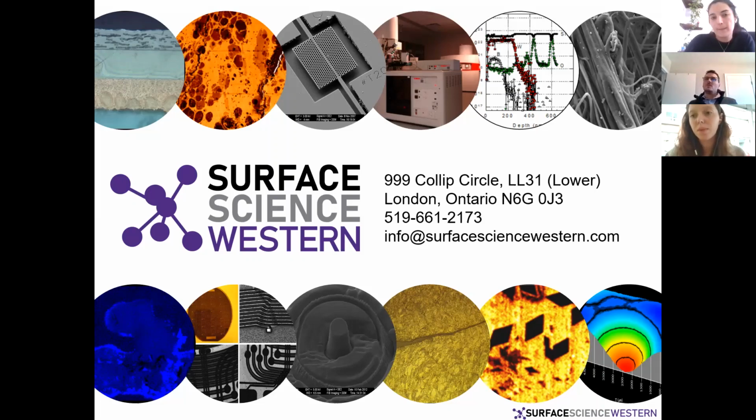So it kind of limits your detection limits a little bit. I like to say you need at least around 10% chromium 6 out of your entire amount of chromium before you can start really saying, okay, for sure I have chromium 6 there. You have to be careful that you're not just falsely putting in a small peak and calling it chromium 6 when really it's just some noise within a chromium 3 spectrum.